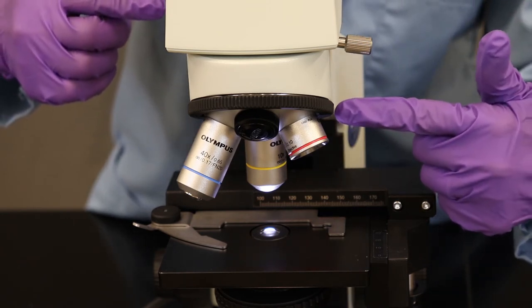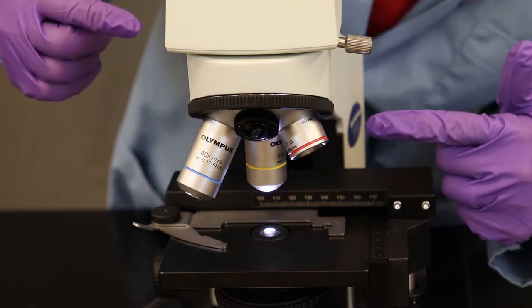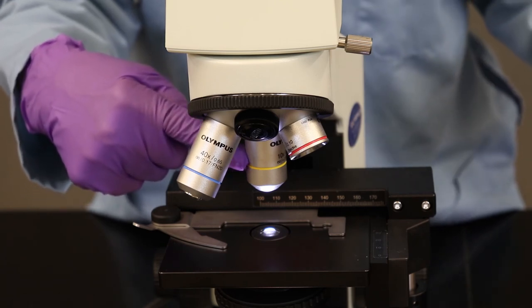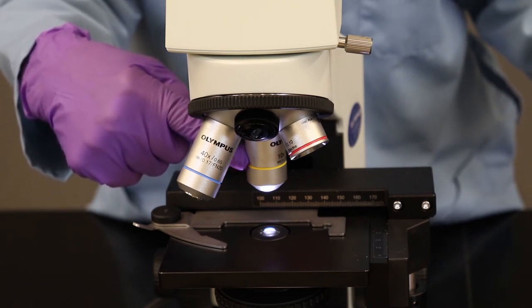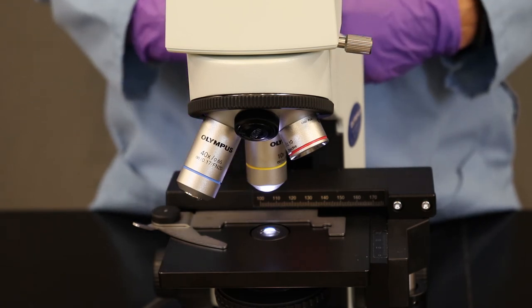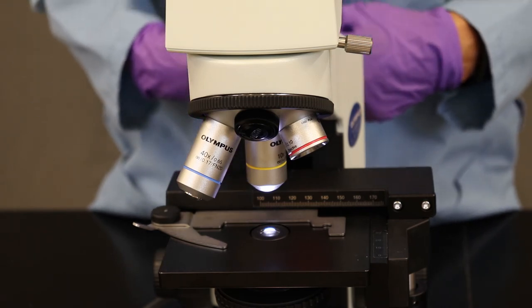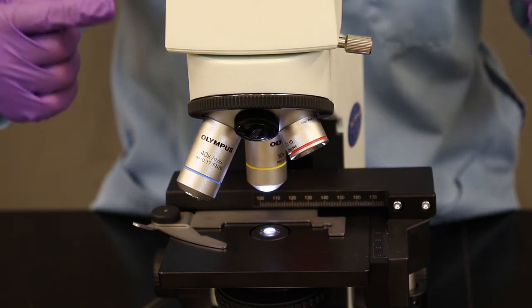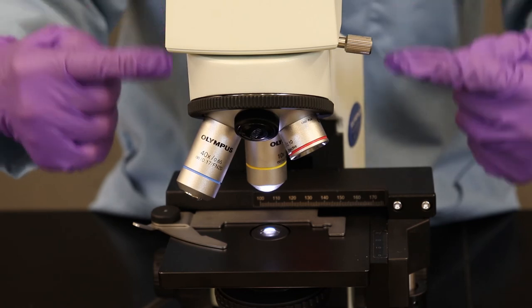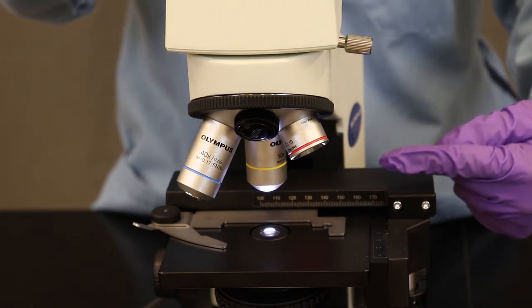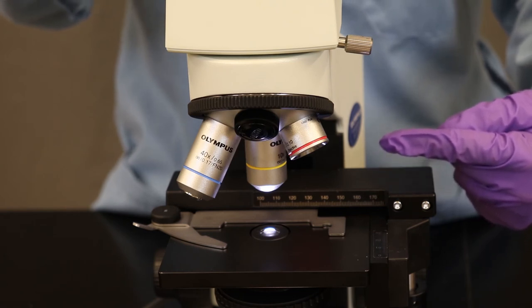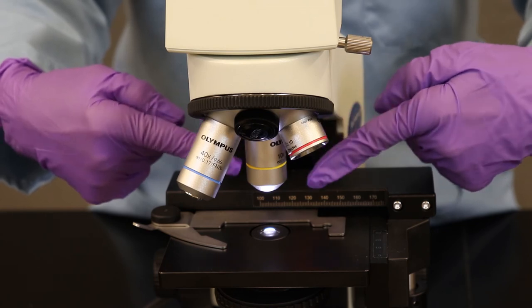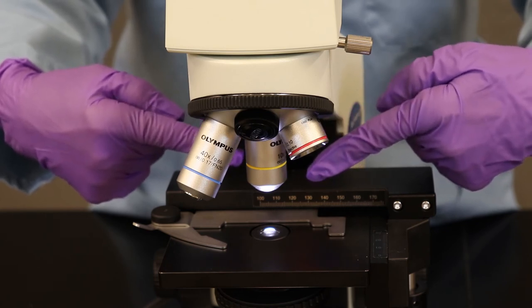But in addition to this little 4x objective, we also have, in yellow here, a 10x objective. The 10x objective adds an additional 10 times the magnification. And it's a multiplying relationship. So the 10x of the objective combined with the 10x of the eyepieces gives us a total magnification of 100x when this particular objective is pointing down towards the stage where the slide is.